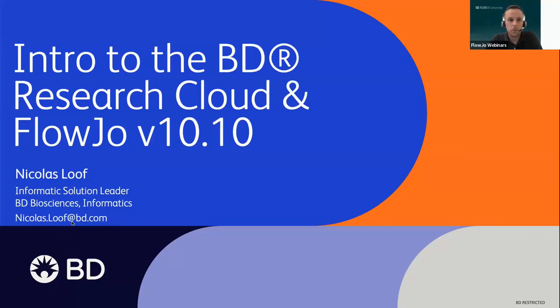So for today's webinar, we're going to talk about the BD Research Cloud and FlowJo v10. Before I jump into the training, we're going to do some slides, and after we're just going to go into a live training on the software.